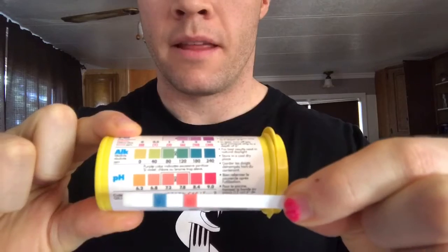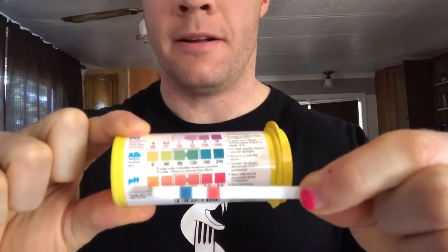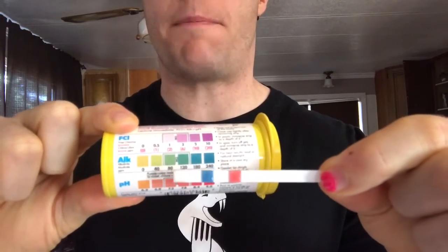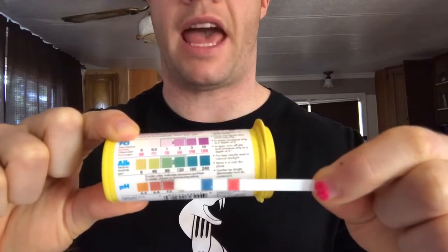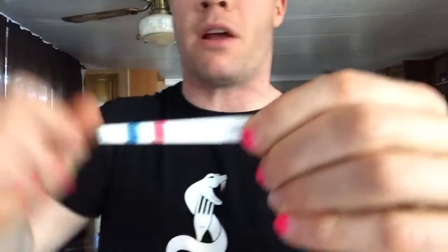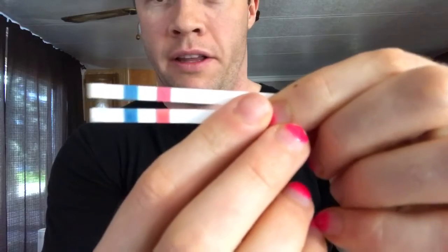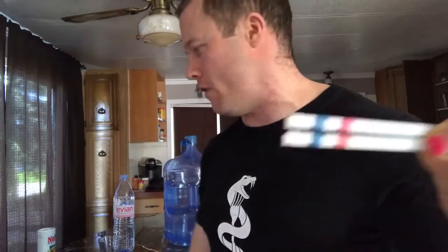Evian water, 7.8 to 8.4 for pH, which is good. 240 parts per million for alkalinity, which is right on the top end. Okay? That's why I tell you to drink the Evian water. It almost pulls the exact same numbers as the spring water, for crying out loud. Here's the two. You can see the Evian is the bottom one. Slightly lower pH. That's why I say to buy the Evian at the store. You're not going to get a better store-bought bottled water than the Evian water.